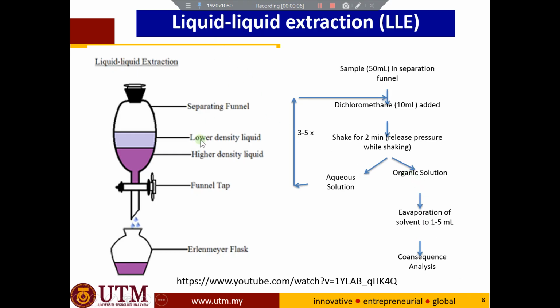Let's go for the pictures of liquid extraction and the procedure. Here is the separating funnel for the liquid extraction. Here we have the higher density liquid, we have the lower density liquid, and let's say here is the non-polar solvent, here is polar, here is polar, here is non-polar. Let's say your sample is non-polar, it will go to the non-polar solvent, non-polar extraction.